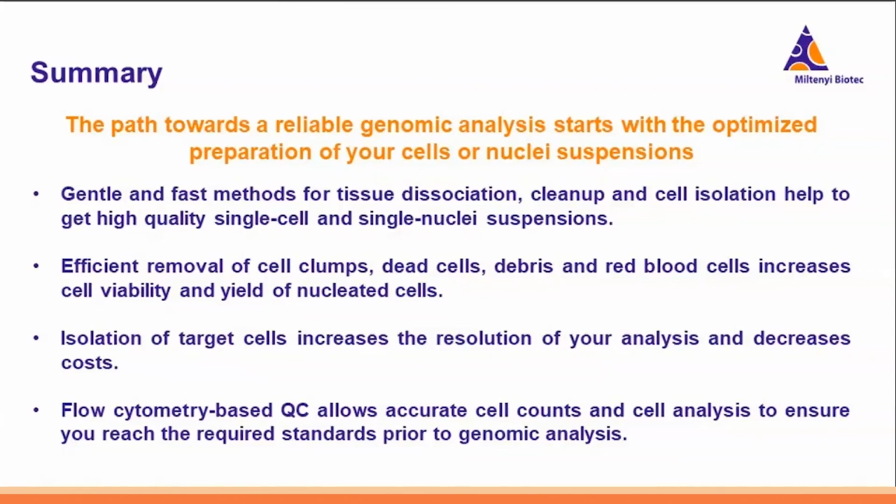And last but not least, flow cytometry-based QC allows accurate cell counts and cell analysis to ensure that you reach the required standards prior to genomic analysis.